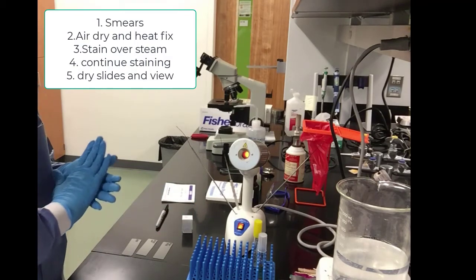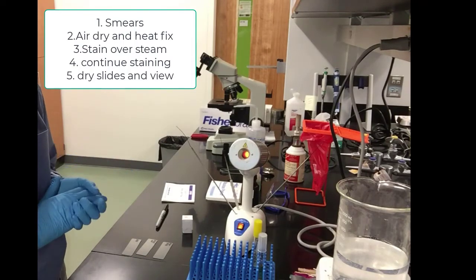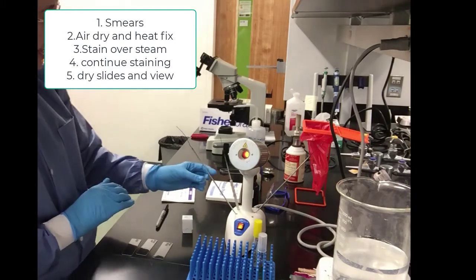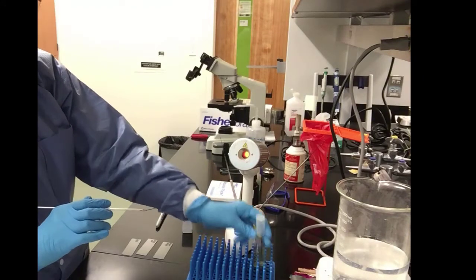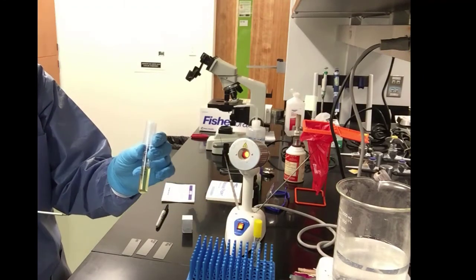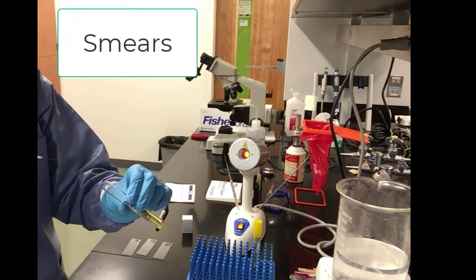So these are the main steps of the lab. So first, we will do our smears. Smears means to place the specimen onto the slide. We will pick up a loop. We have sterilized our loop, of course. And the first bacterium we will pick up is the Mycobacterium smegmatis.